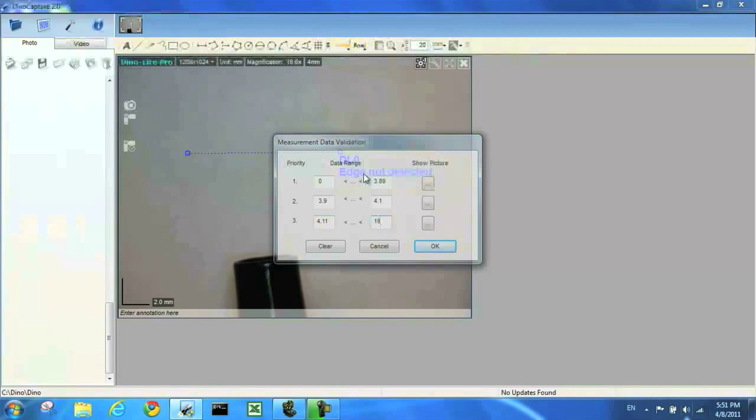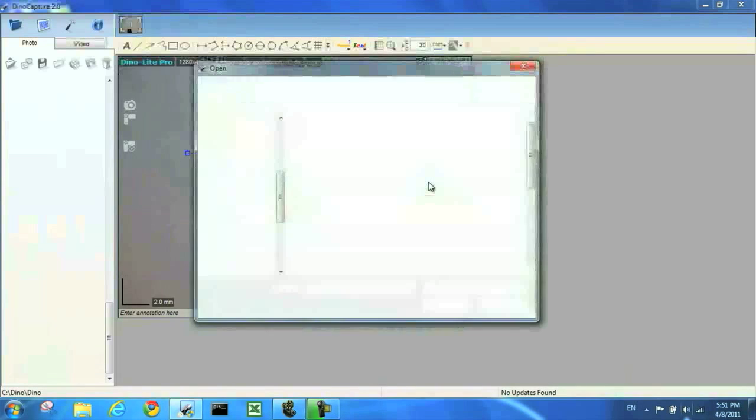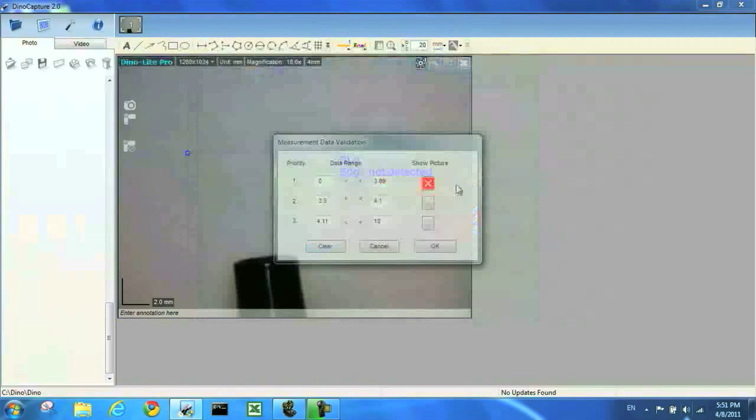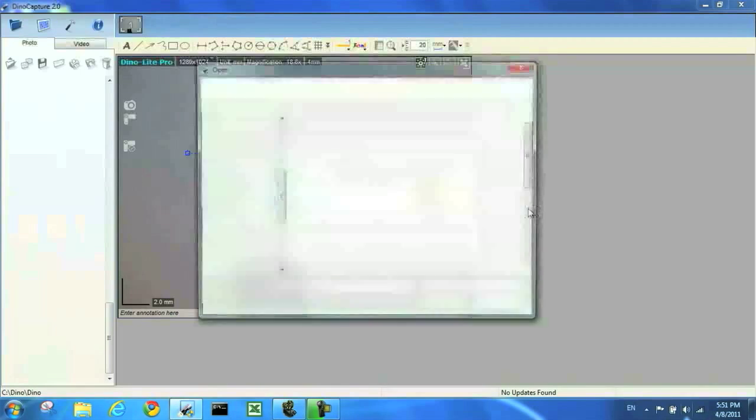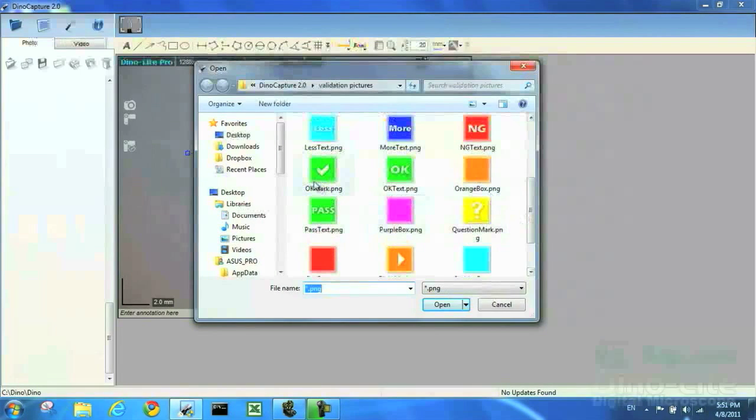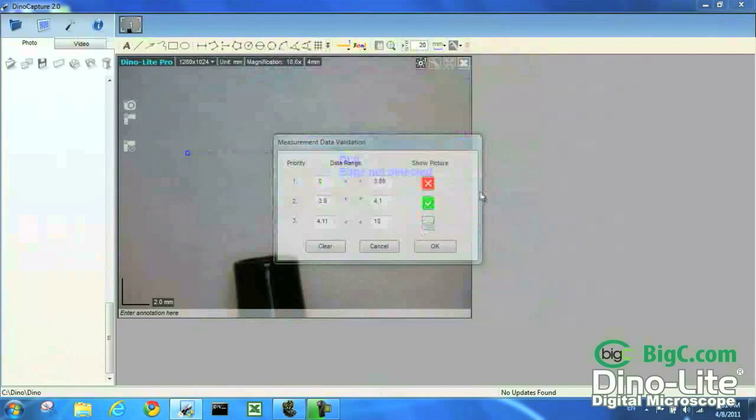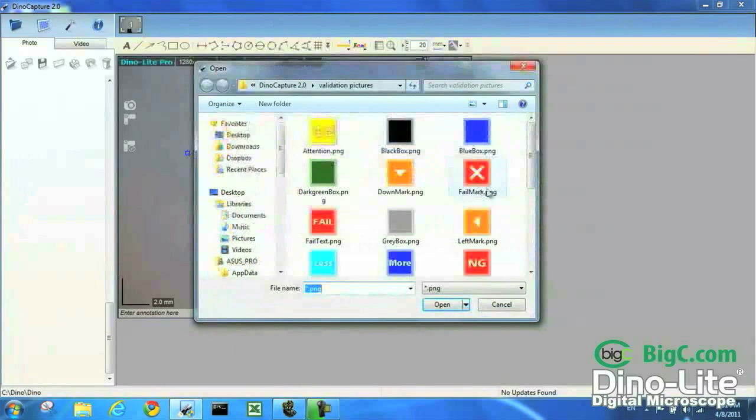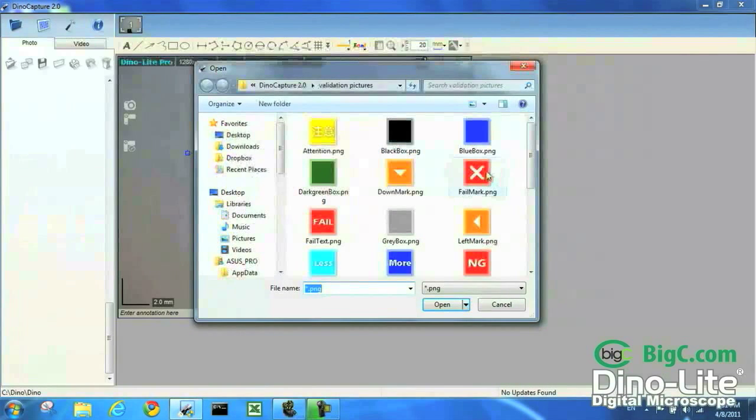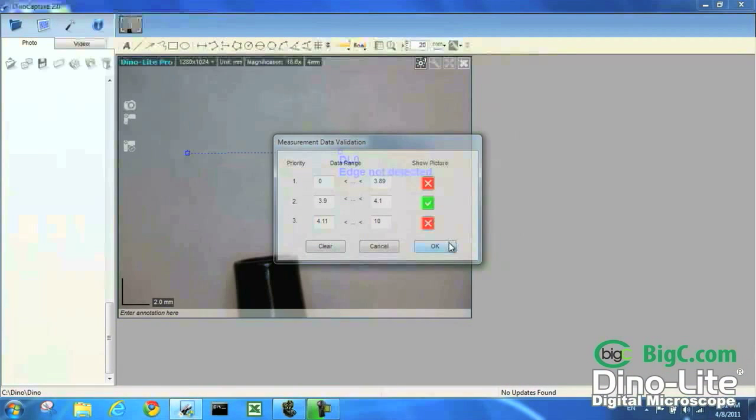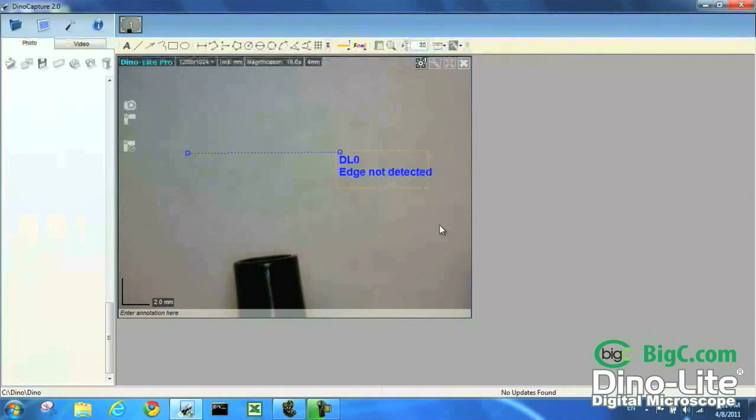Now I want to choose some pictures to show for the pass and fail ranges. Okay great, we're all set up. Let's test it.